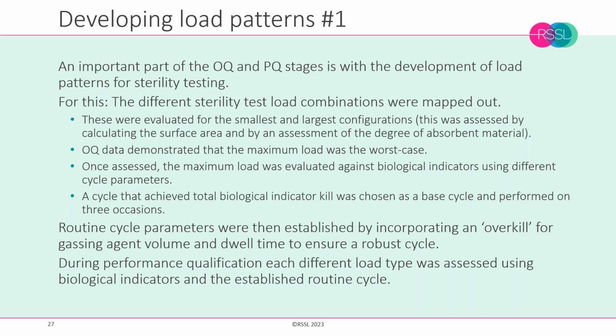It's also useful to understand the point between pass and fail. So this can be full-blown fractional negative studies, or it can be assessing just between the point of passing and the point of failing, and then building in a sufficient overkill cycle as well. And understanding where pass and fail happens, I think, is really useful knowledge.